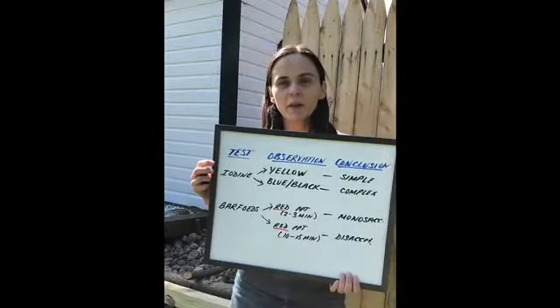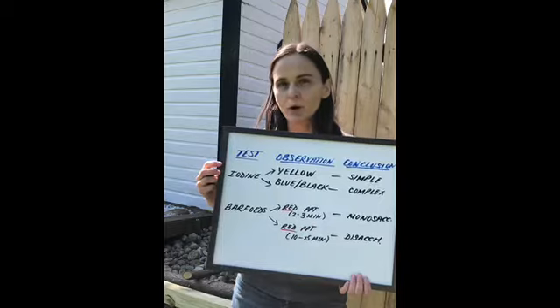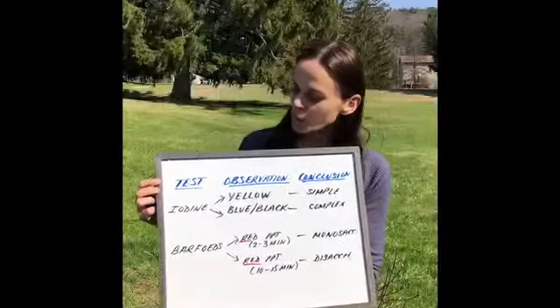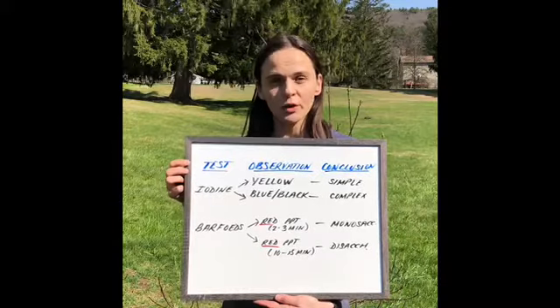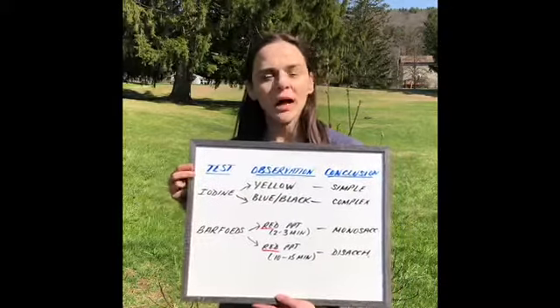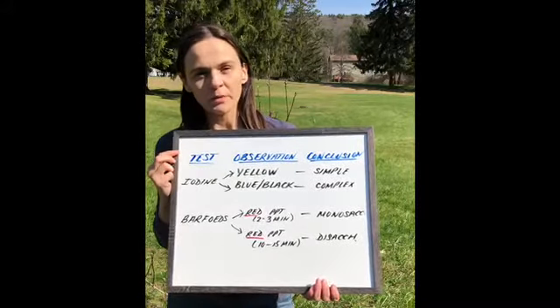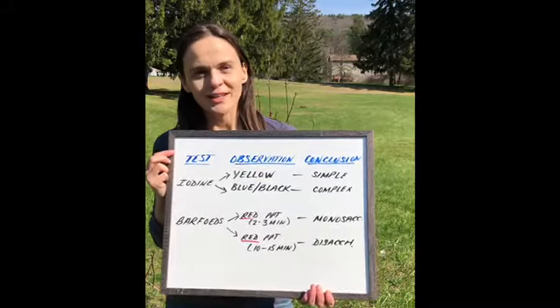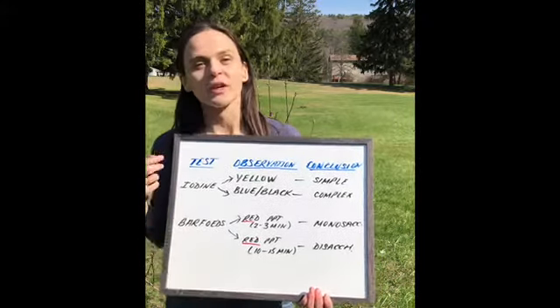In the lab, you would be using different reagents to distinguish between and classify different carbohydrates. For example, with the iodine test, you would conclude whether your sugar is a simple sugar or a complex sugar based on your observations. And with the Barfoed test, you would be able to conclude whether your sugar is a monosaccharide or a disaccharide, again by looking at the observations. Carbohydrates are found in many different foods. Let's see what Emily and her sisters have to say.